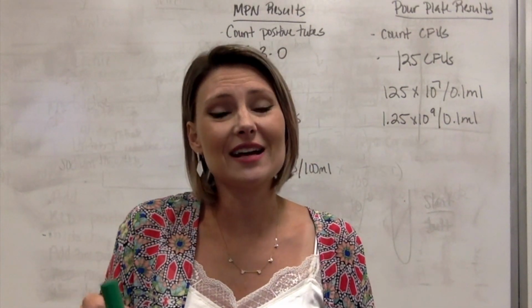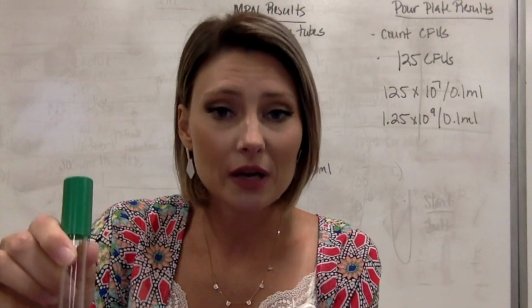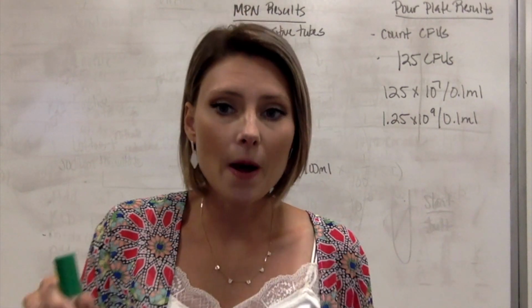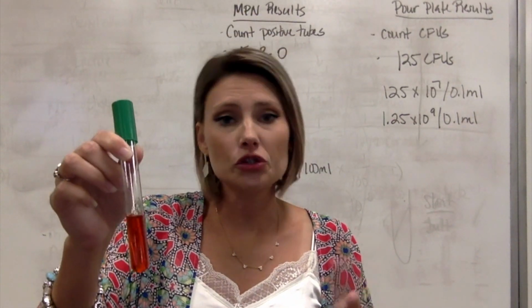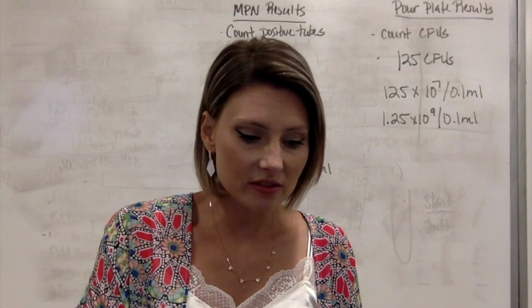The phenol red is not necessary. You can just use the lactose broth with a Durham tube in it, because remember, when E. coli ferments, it produces the gas, so you look for the gas bubble and growth. But the color just makes it easy for us to do, so that's what we're going to do. So we have the phenol lactose broth.